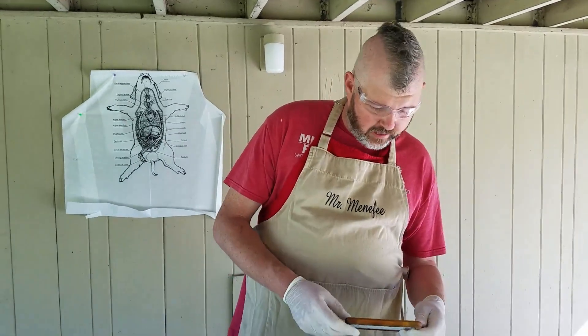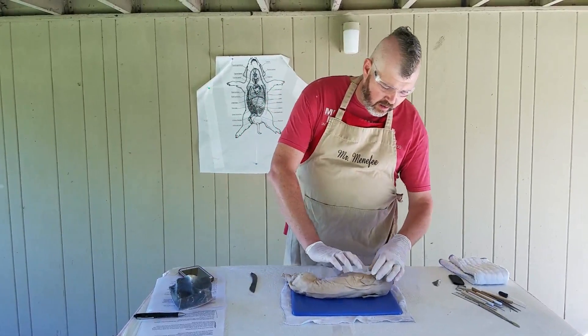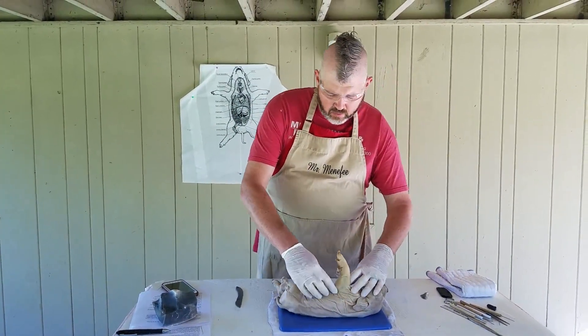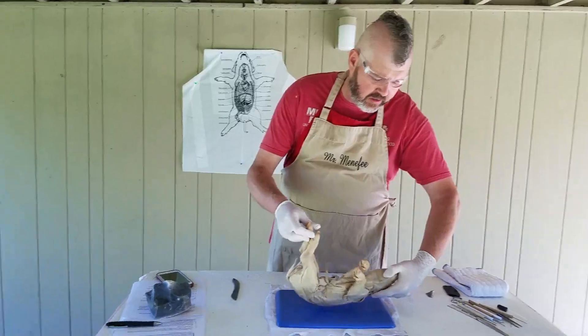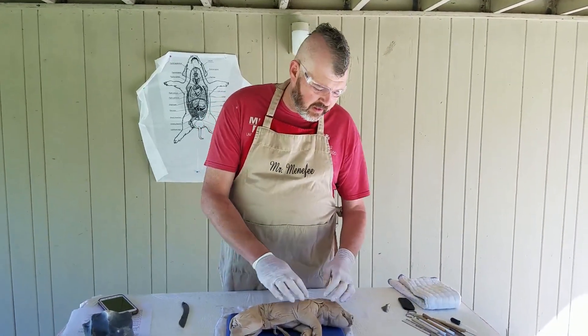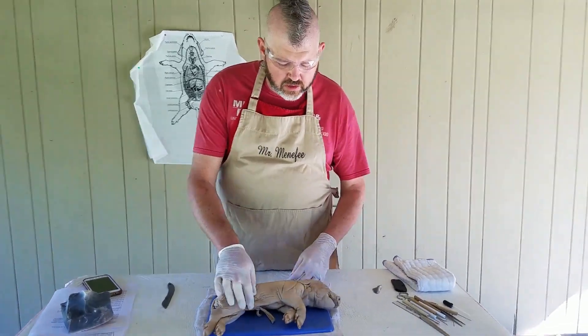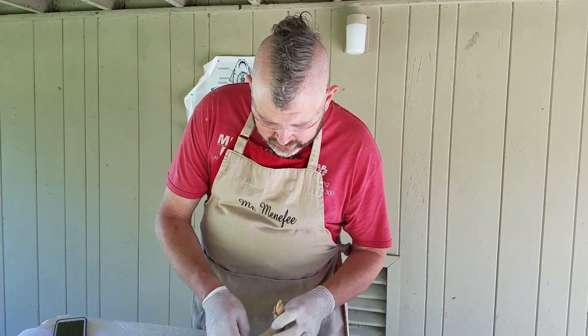You're not just photographing, hey, there's the pig's head — no. You're going to photograph the entire body. We're going to go over every inch and we're going to look for any tattoos, any distinguishing marks. We're going to flip the pig over. So we're going to be looking for distinguishing markings, tattoos, piercings, anything like that. In addition, we're also going to be checking the body for track marks — any sign of intravenous drug use.